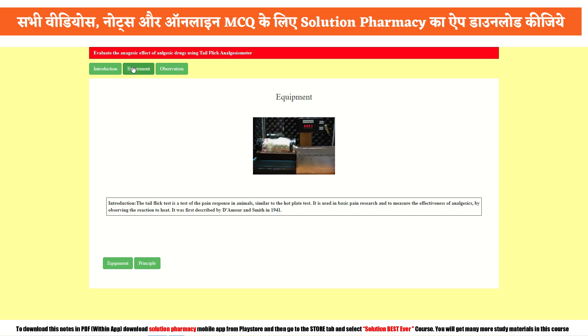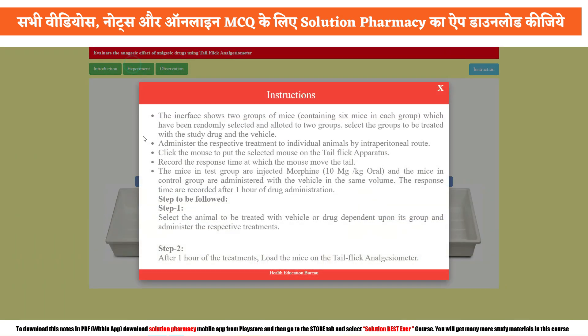Now click on the experiment section to start performing the experiment. This is the basic instruction and procedure. If you want to note it down, you may pause the video and take a screenshot — this will serve as your procedure.